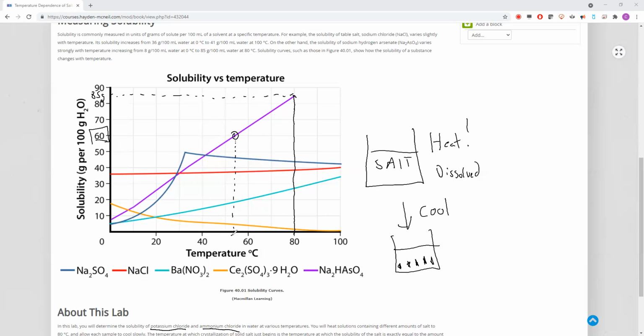All right. So at 54 degrees centigrade, you can put 60 grams of the salt, which we did, into water, and it'll still be soluble. If you get any temperature below this, and as long as you're stirring, salt will come out. Salt will crash out below that temperature.